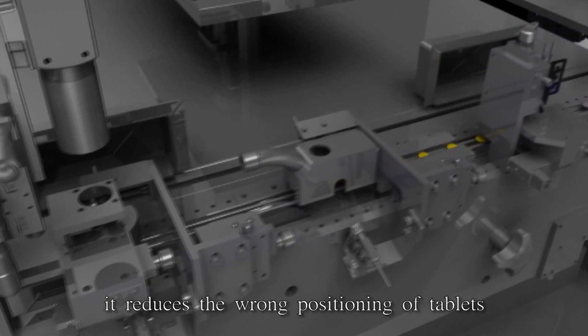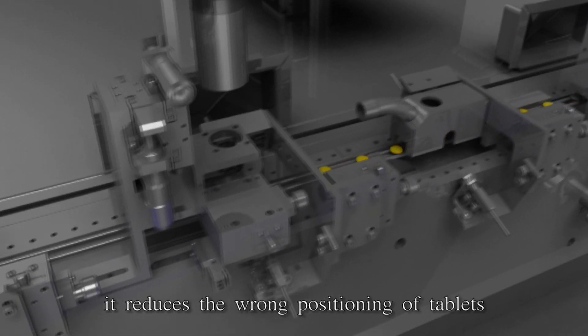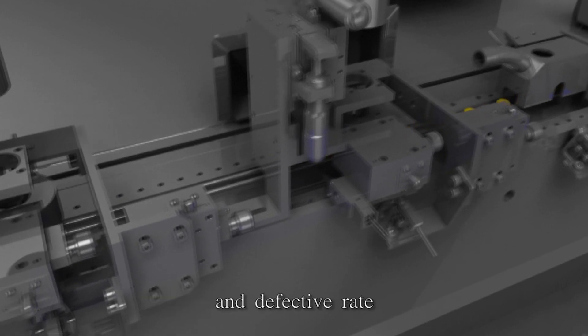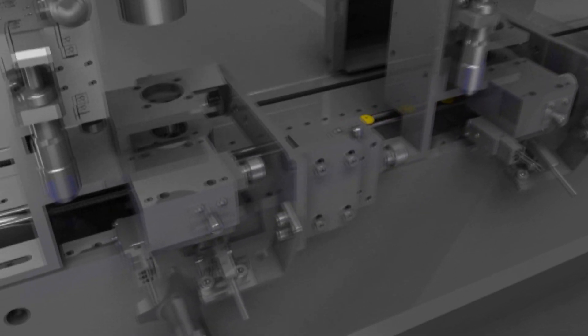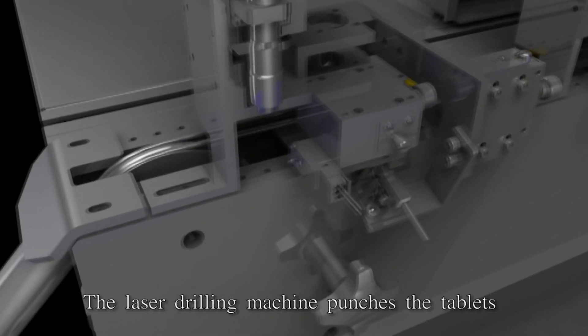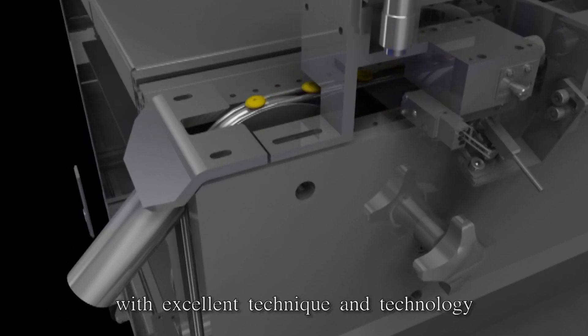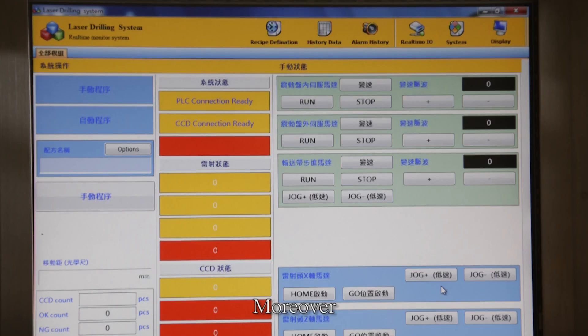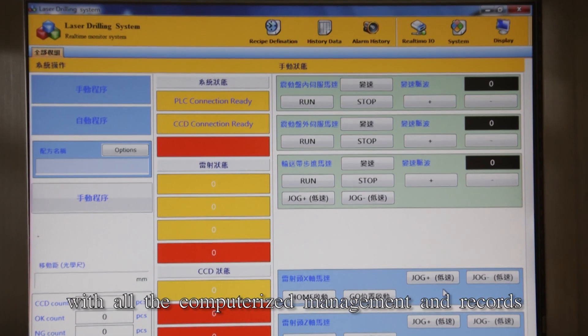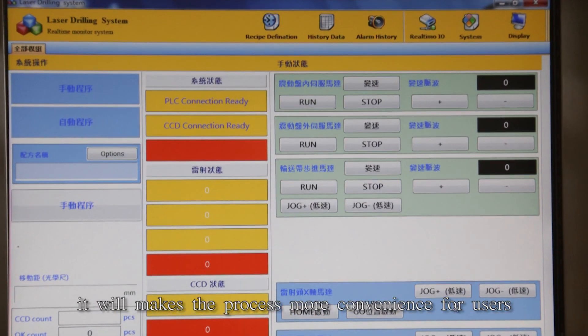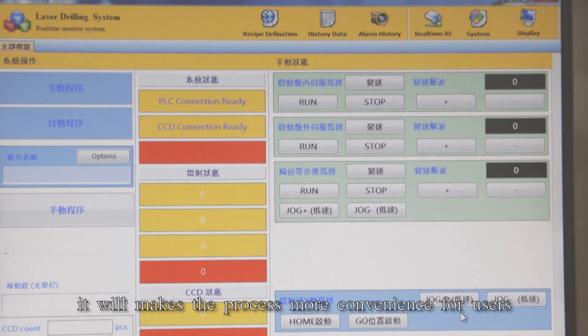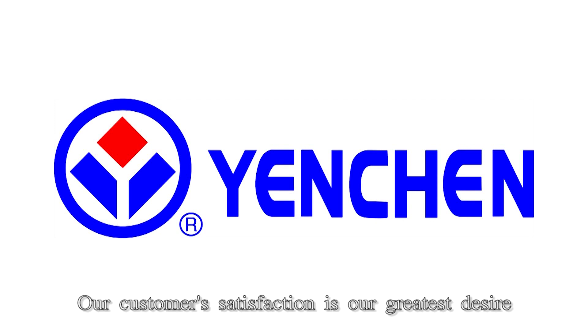Moreover, it reduces wrong positioning of tablets and improves production speed and effective rate. The laser drilling machine punches tablets with excellent technique and technology. With computerized management and records, it makes the process more convenient for users. Our customer satisfaction is our greatest desire.